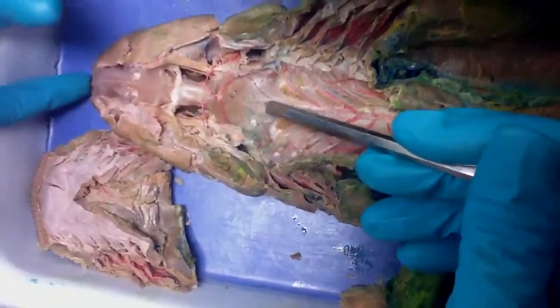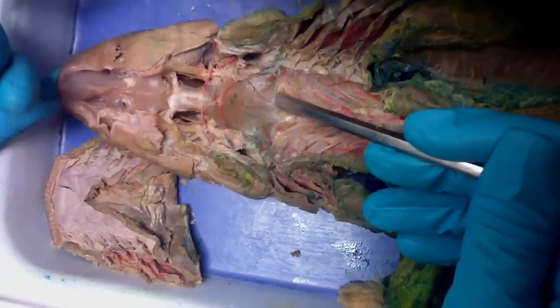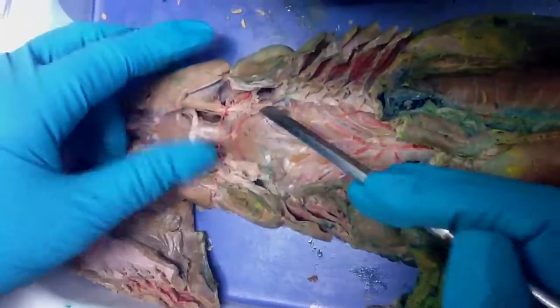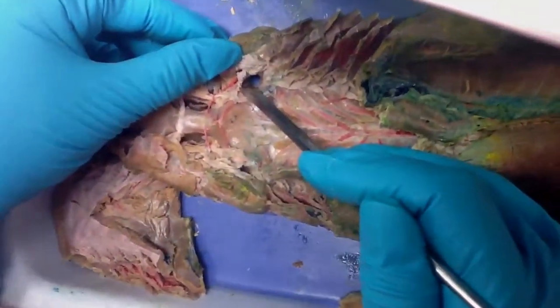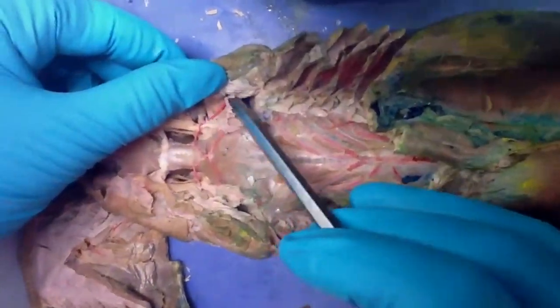And this is the chondrocranium. What's the name of the shark's skull? Anyways, you can see the rostral keel here. This is just a deep dissection. And then we got our spiracle, which is the hole. And then we have an efferent spiracular artery that runs right by the hole.